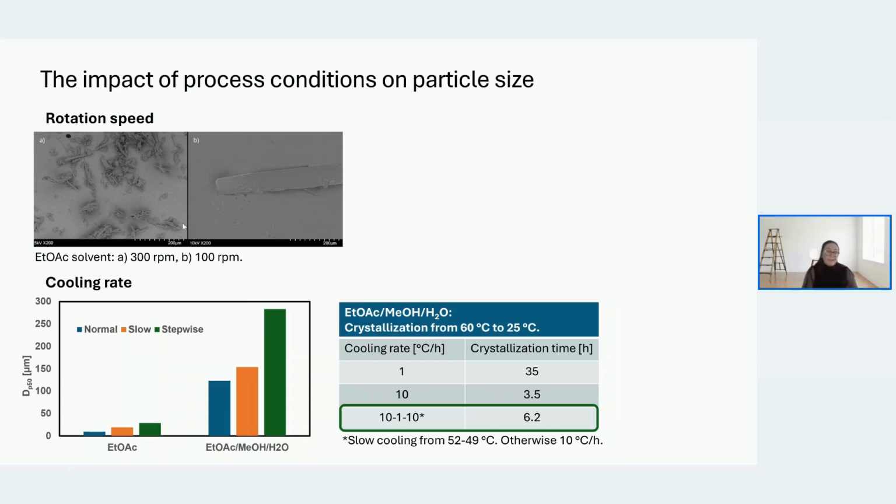And obviously this mixing overall is something that needs to be optimized according to the used solvent system, used concentration, and of course scale and impeller that you are using. And clearly it is an important parameter when you go up in the scale with the process design.